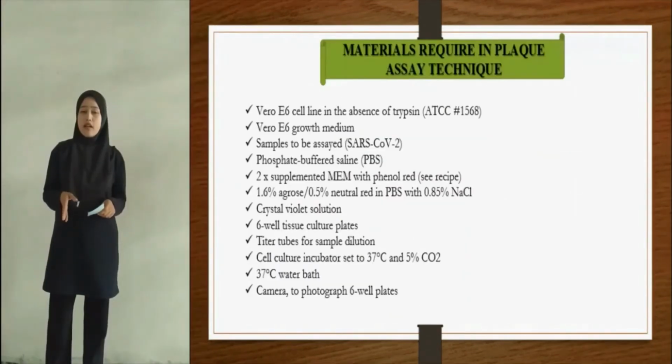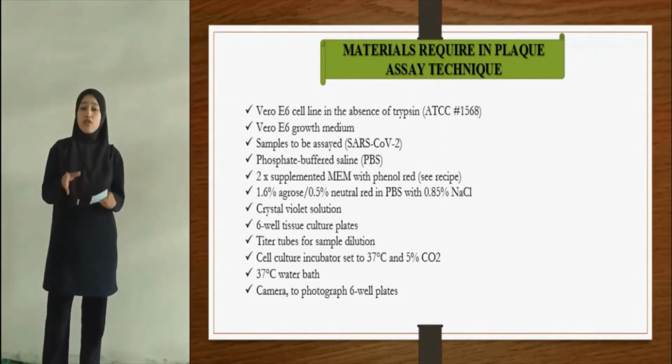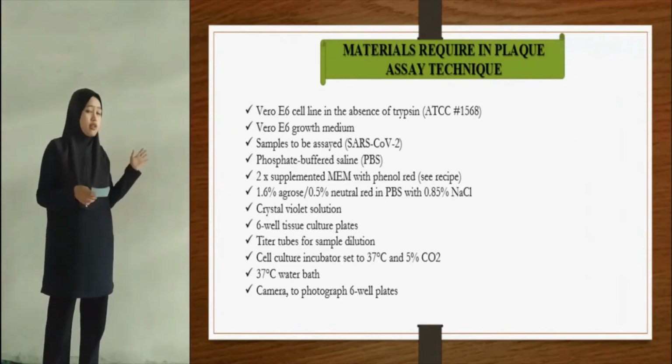For the materials in the quantification of SARS-CoV-2 using the plaque assay, what we need to prepare is as I showed in the slides.